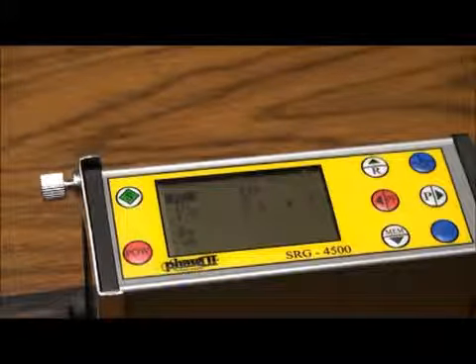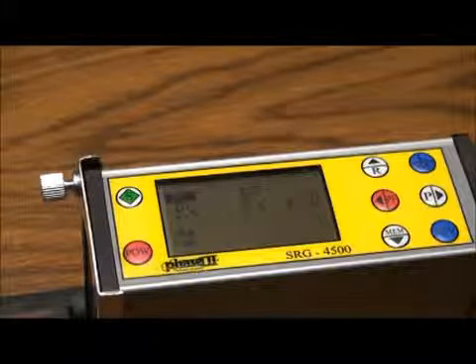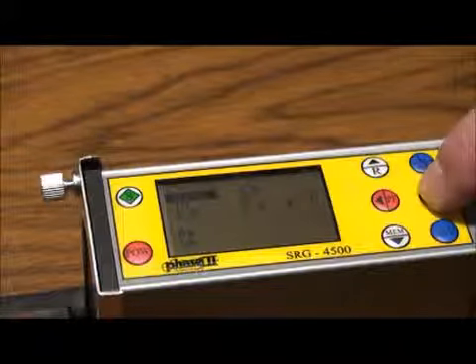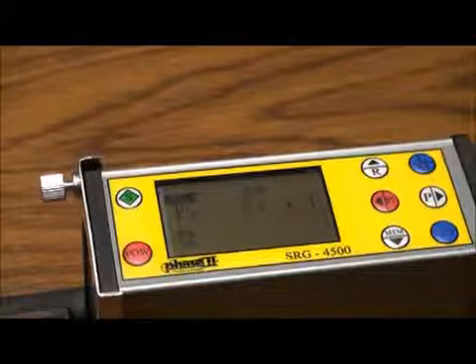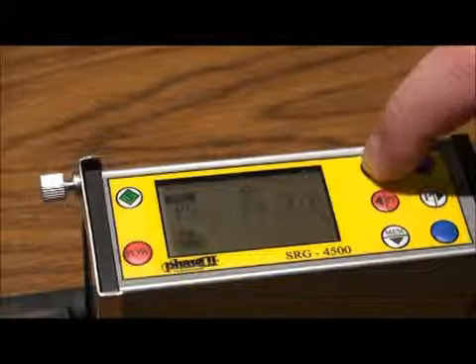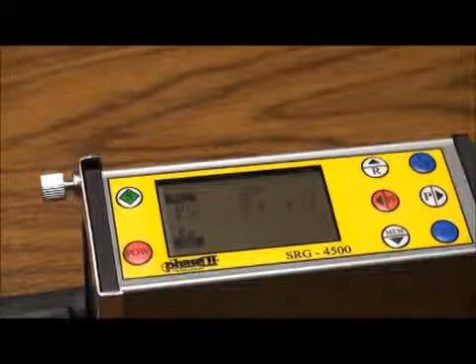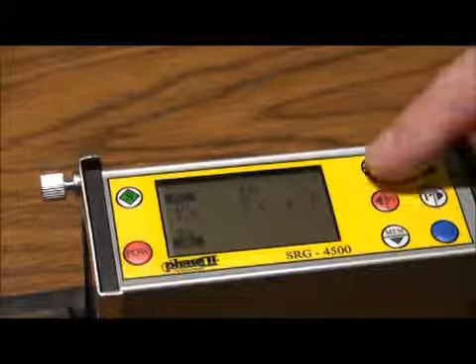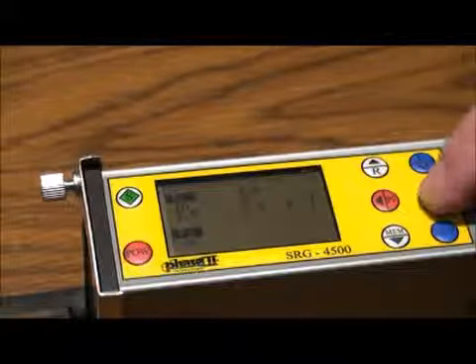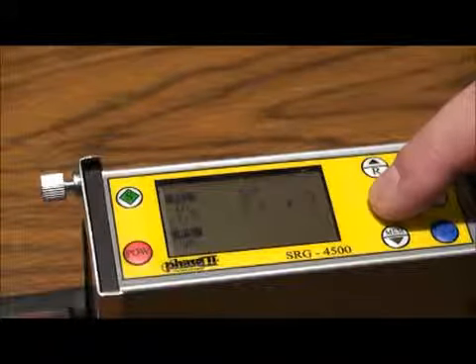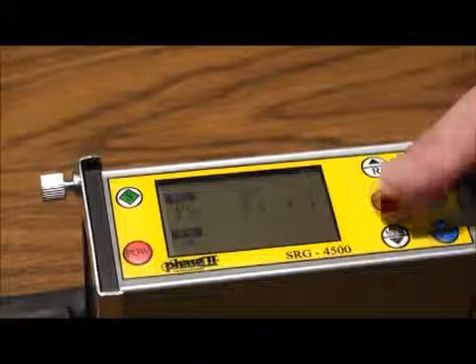From the quick menu screen, we can change the filter, of which RC is default. We can change the measuring unit, inch or metric. We can change roughness parameter, which is usually determined by your requirement. If no parameter is called out on a drawing, it usually defaults to RA.